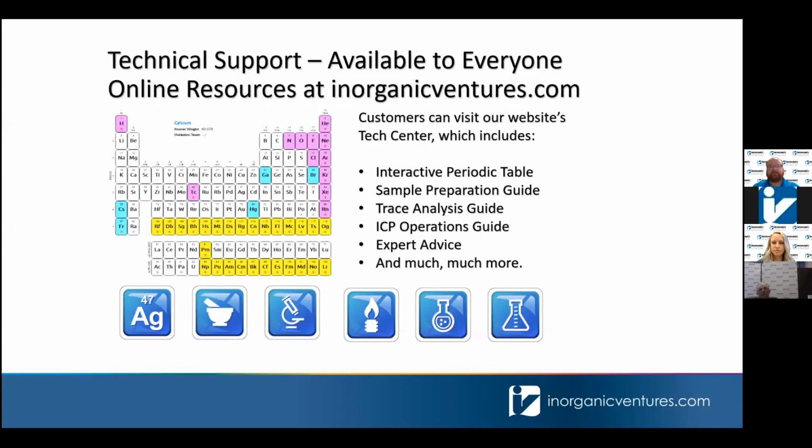But I have not, to my knowledge, and we have a lot of customers that use mercury and do cold vapor. In fact, that's the primary method still, and I think one of the best, if not the best. But we do not use that here.